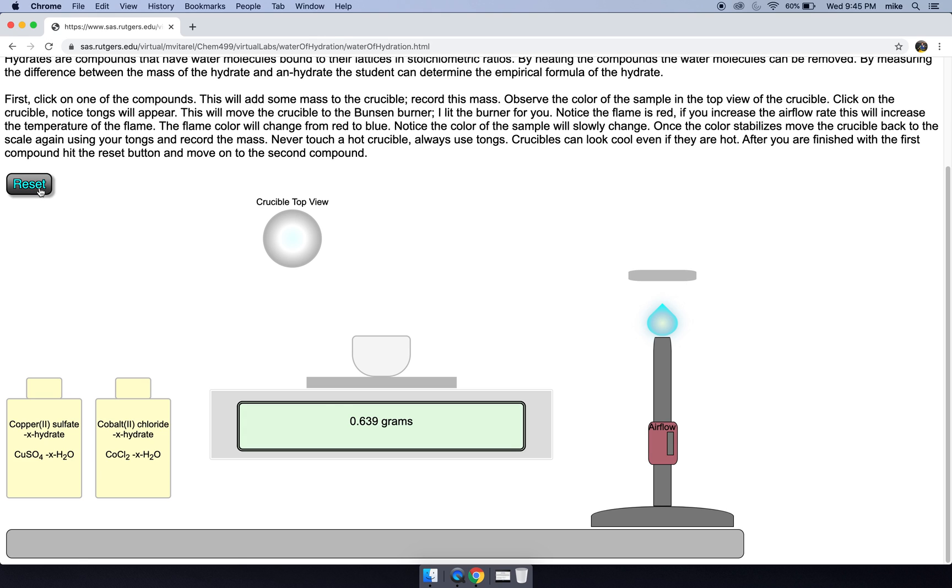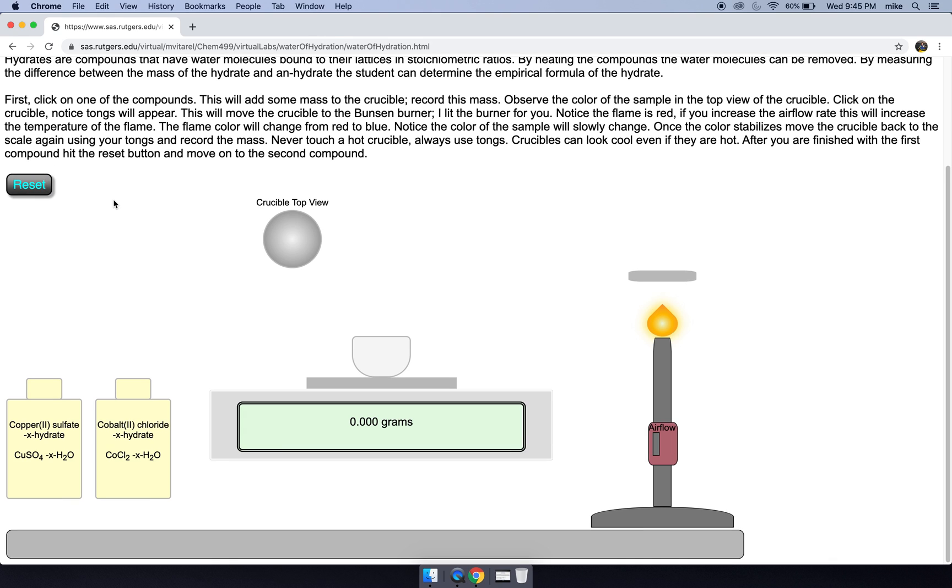Let's use our second sample, our cobalt 2 chloride. So we get 1.00 grams of that and it's purple, a rather pretty sample.